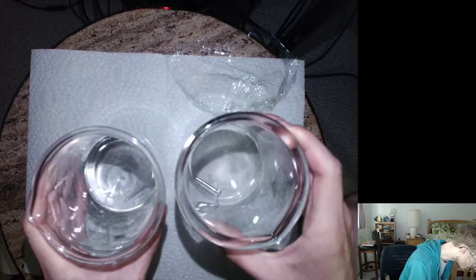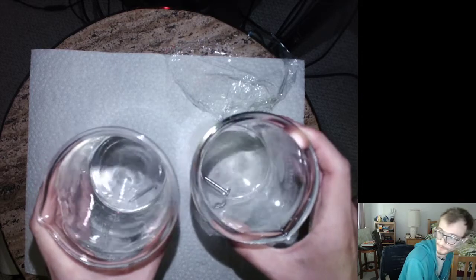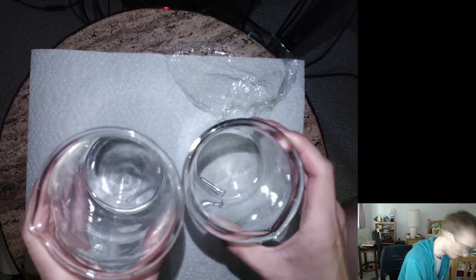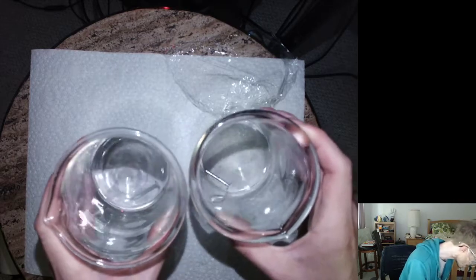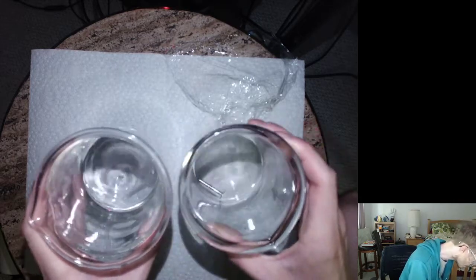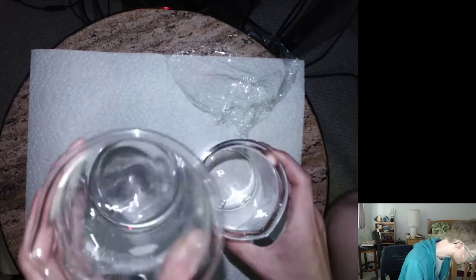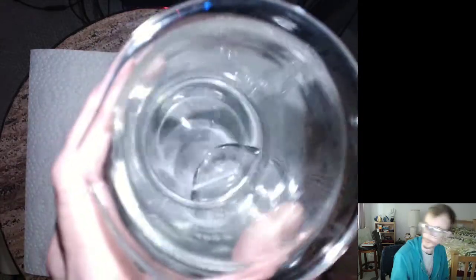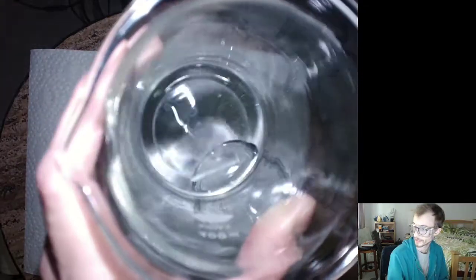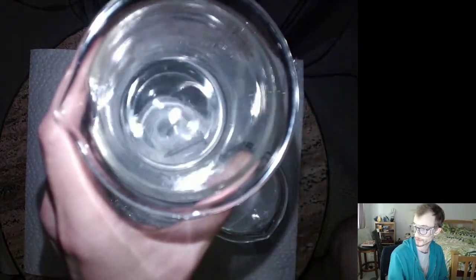You can see almost immediately that there is some bubbling going on right here. Let's see if I can get it to focus. Oh, I've got to turn the lamp off. There we go.